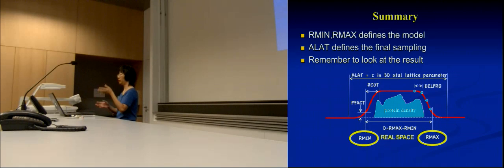Because when you apply symmetry, you fold this back onto the negative side, assuming there's that inversion I talked about, and put it over here. Now, if it doesn't really have that inversion property, then it's going to end up falling out somewhere else. So you end up with too much. Then that tells you that you applied too much symmetry.